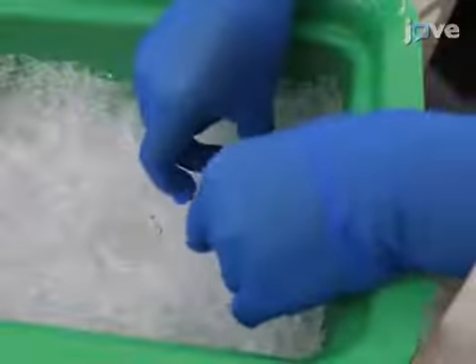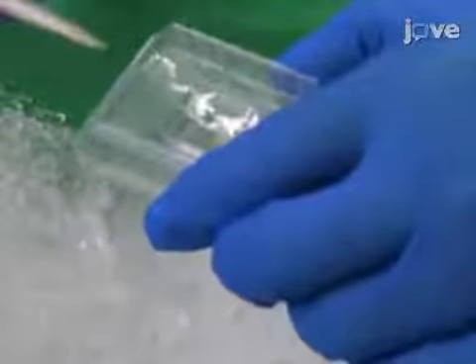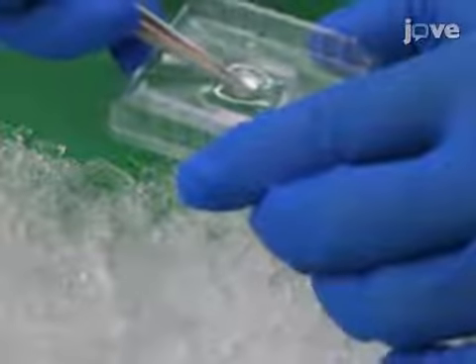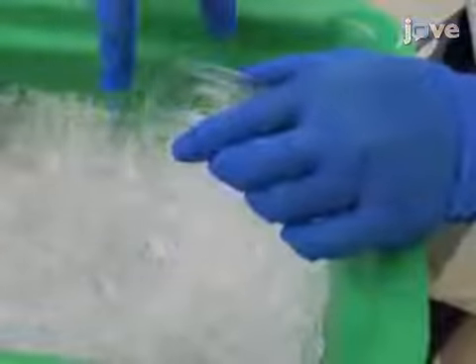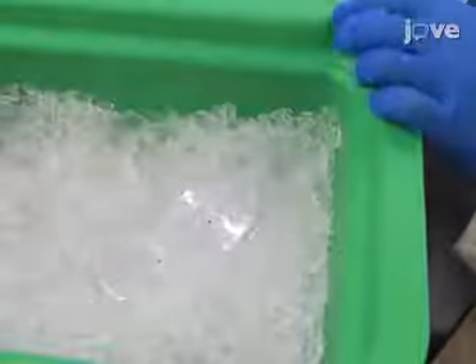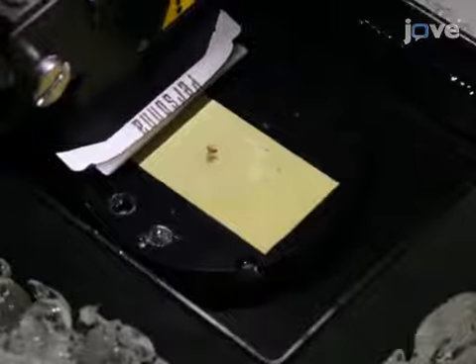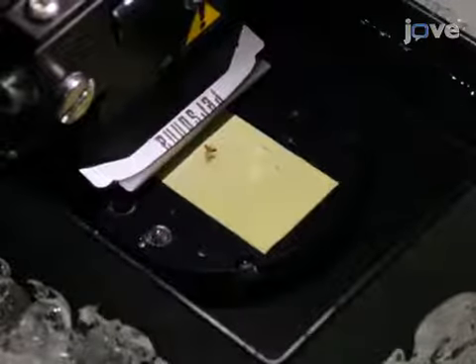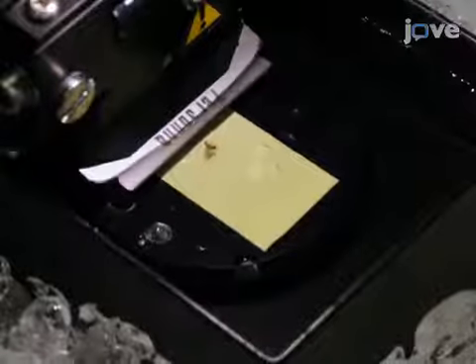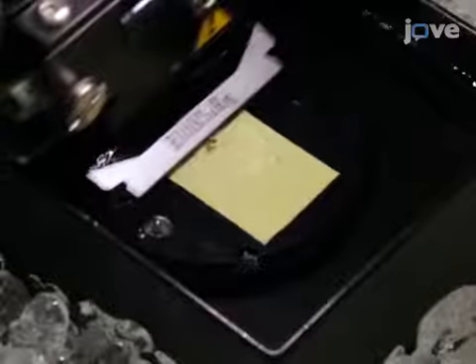To begin the experiment, anesthetize 5 Drosophila specimens on ice and immerse each fly in 1 milliliter of 4% low-melting agarose in phosphate buffer. Allow the agarose to solidify on ice. Then, use a vibrating blade microtome to section agarose gel-embedded Drosophila into slices with 100 micrometer thickness. Immerse the slices in fixative solution containing 2.5% glutaraldehyde in 0.1 molar phosphate buffer.